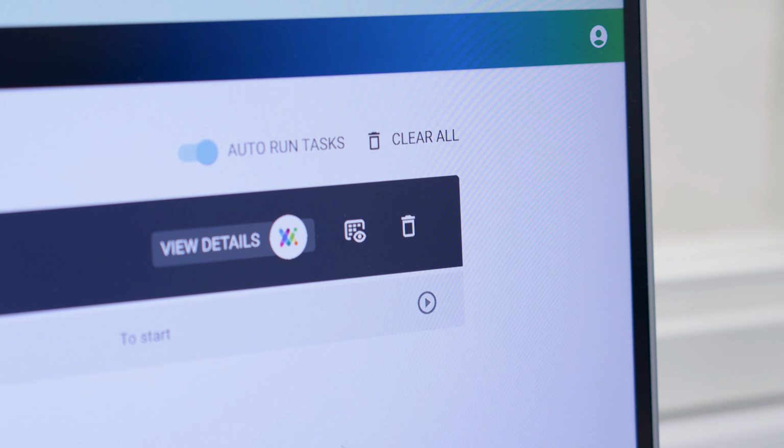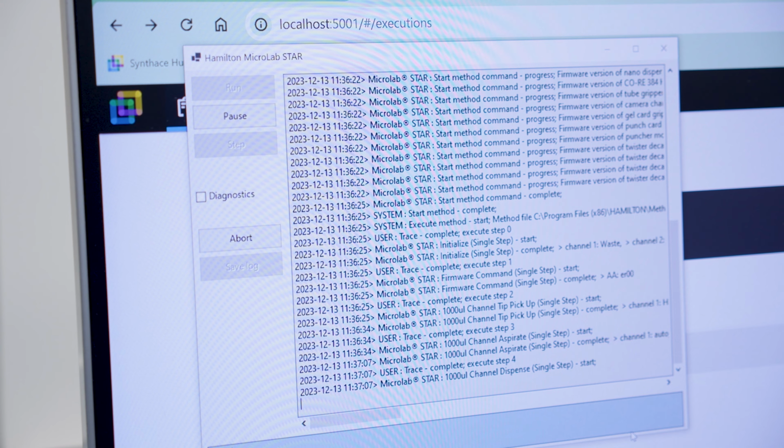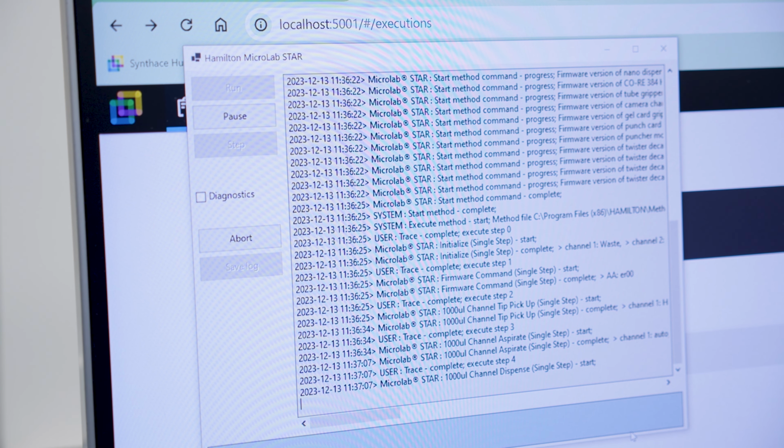Then back on Synthace Hub, just press play. The device plugin window will open. This shows all the actions that the Hamilton is performing. You don't need to interact with this, but you can use it to pause or abort an execution.